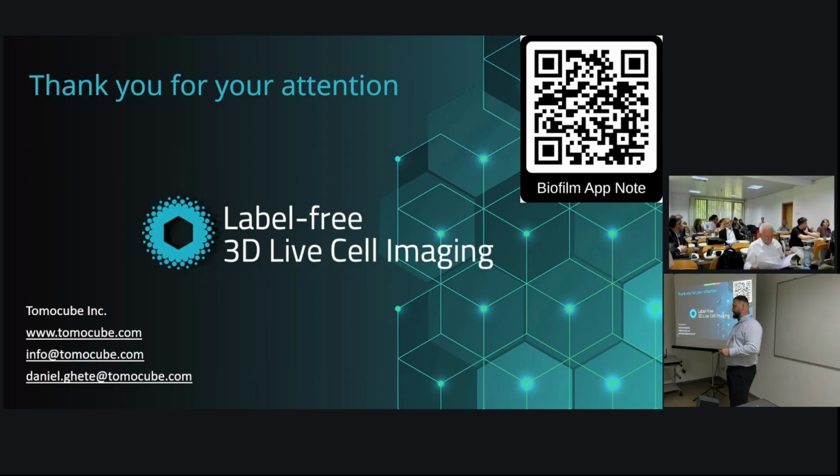You said you offer high resolution, even to resolve distances like 100 nanometers, thanks to a scientific approach. Could you please explain what it means? Yeah. So in this case, it's hard to see, but what we're using is a big condenser because we still need a high numerical aperture to project the light at an angle. So we're using different parts of the numerical aperture. So in theory, we can project light as we want from the DMD.